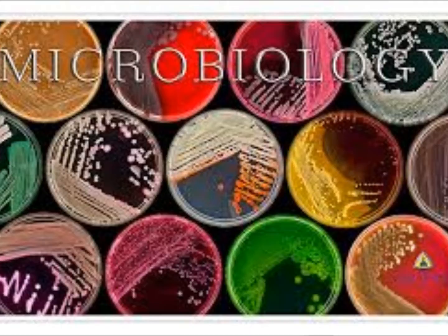In our lab, a lot of our work came in on the evening shift, so we only read 48-hour cultures in the morning and read our new cultures in the afternoon. So you'll see the size changing from the 24 to the 48.